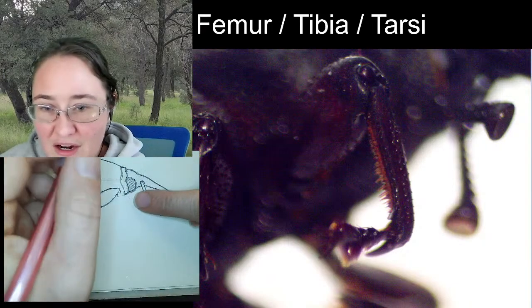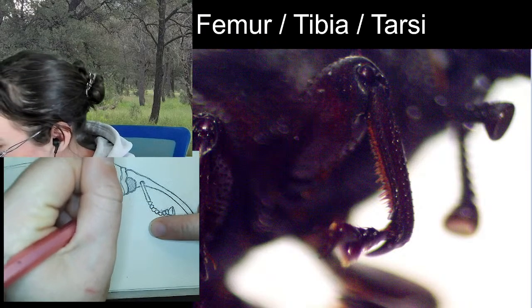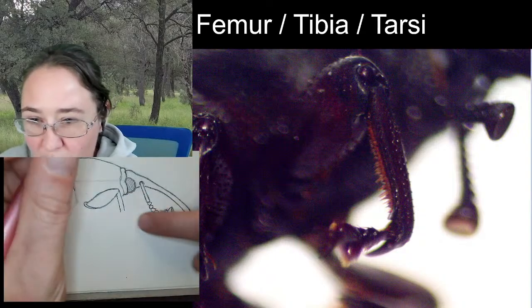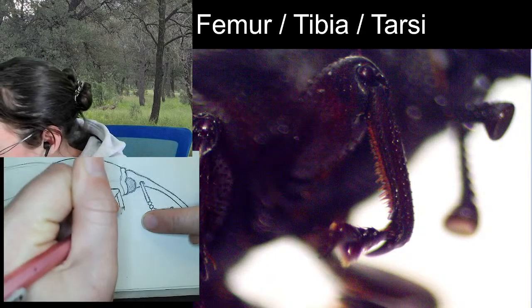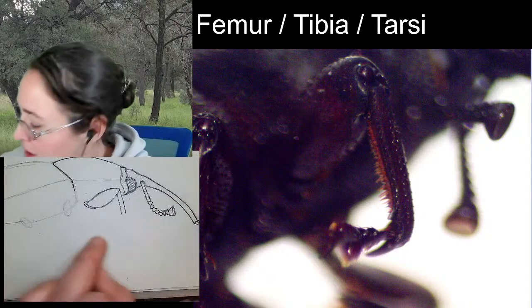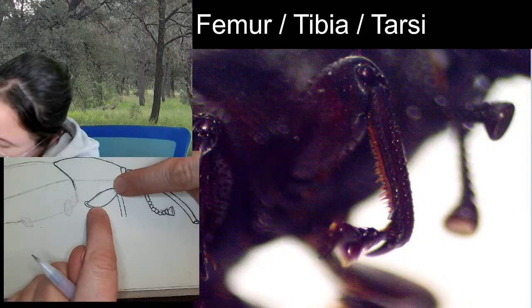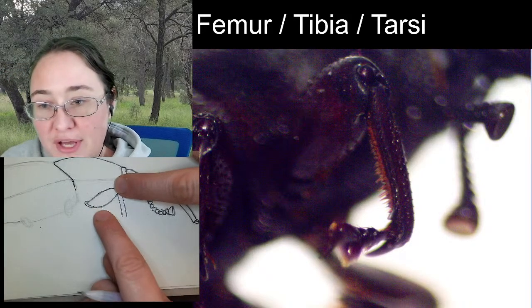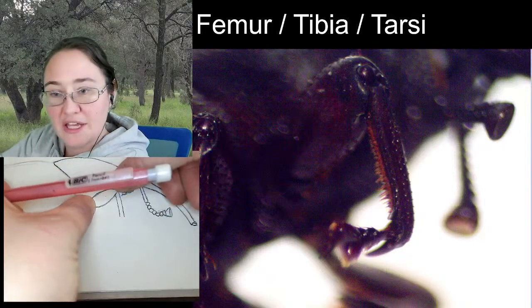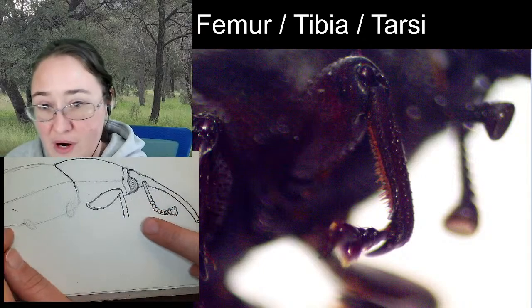So from here, we're going to take that tibia and go pretty much straight down. You can see that it's parallel to itself, and it doesn't get much wider or thinner throughout most of its length. I'm going to make our tibia about... if you imagined your tibia closing, it would be able to touch the trochanter. So from here to here on its leg as it swings open, that's about how long it should be straight for.